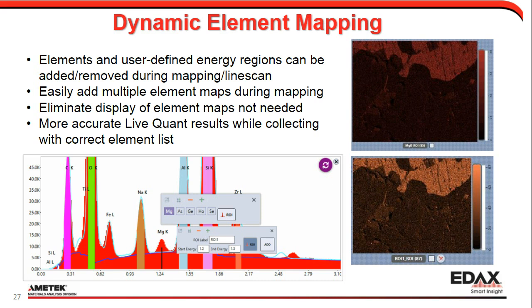New element maps will show up in the Multimap View window automatically, and you don't need to manually delete the element maps from the window.